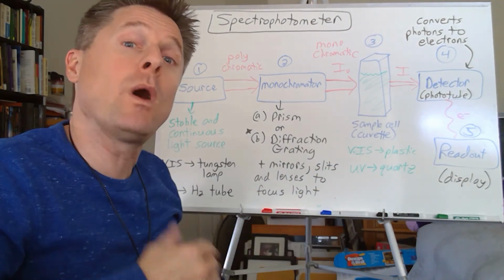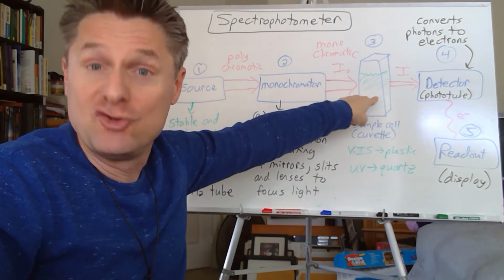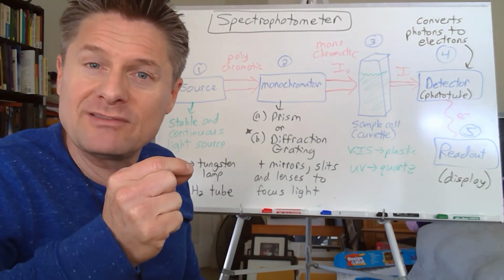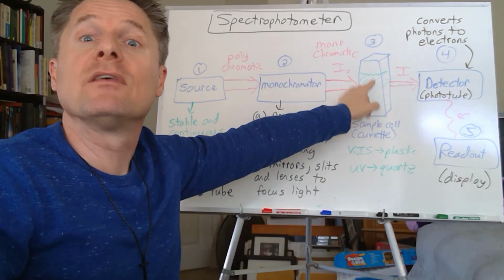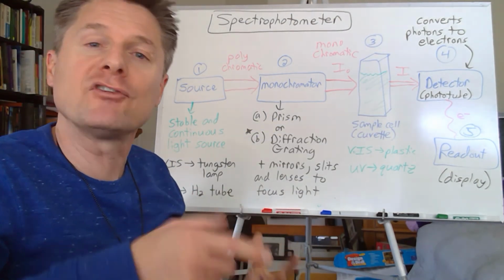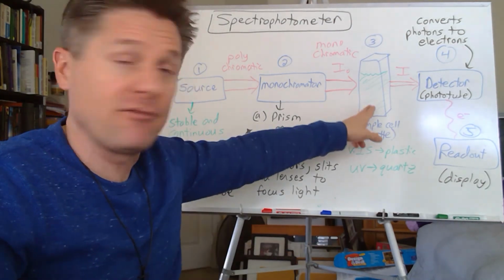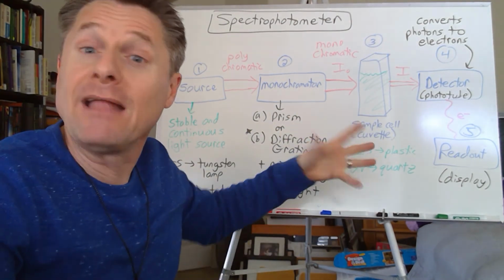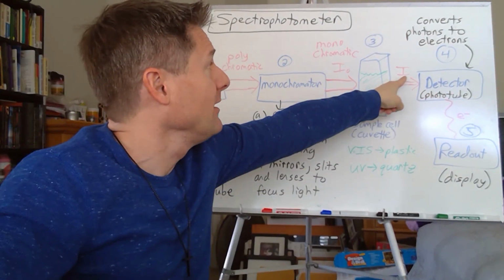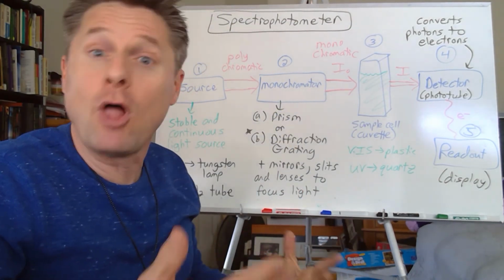Mostly the solute. So what we have to do is run this again with what's called a solvent blank, which is the cuvette with just the water or whatever solvent you're using. Run that. That'll have a really tiny absorbance. Subtract that from the absorbance of the initial sample, and that will leave you with just the solute. That's what we're after. So you're going to see on your data table a little blank or solvent blank we have to measure to correct for the solvent in the cuvette itself. And each cuvette's unique, right? Well, once we get that, we measure the intensity after over the initial. That's the transmittance. Do the negative log, we get the absorbance.